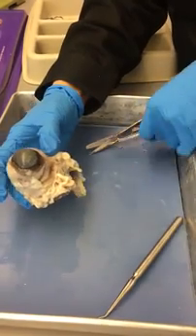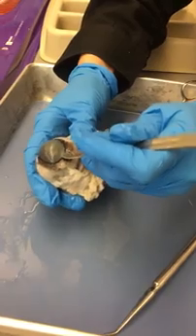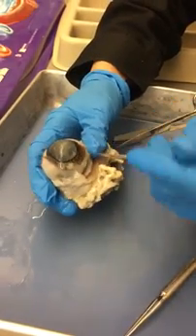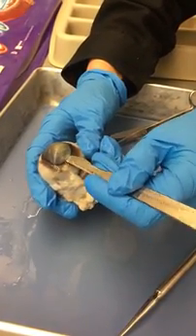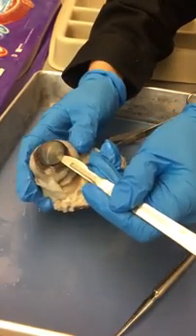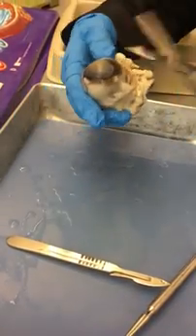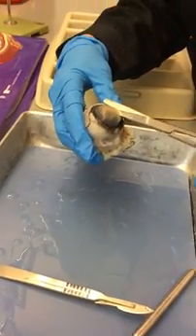So first what I'm going to do is gently make an incision, and be careful with this because there is a lot of preservative in there, so you don't want it to get on your clothes or anything like that. And then once you make that incision, you can, if you'd like, pick up scissors and cut around it.